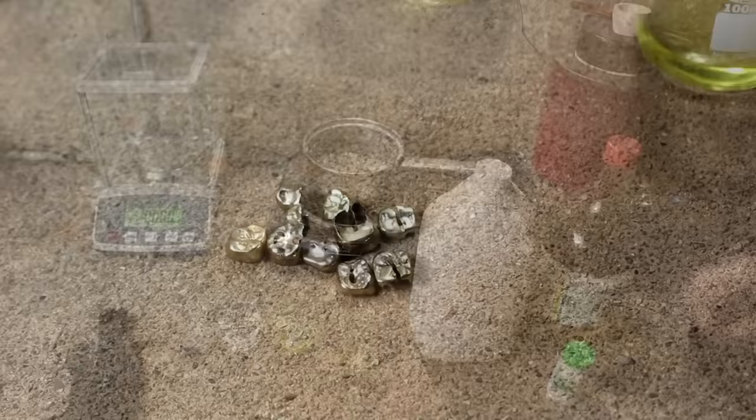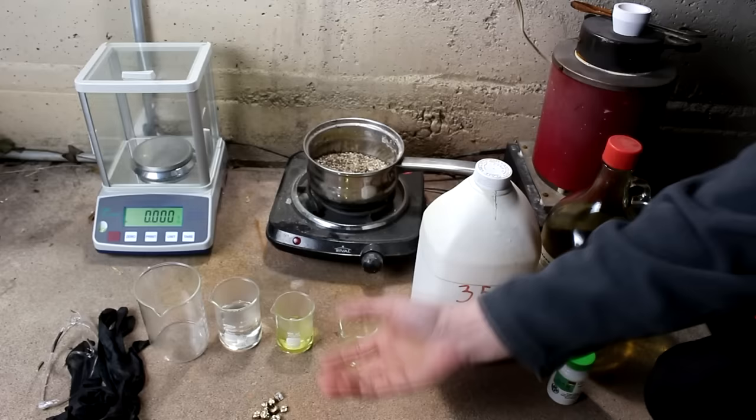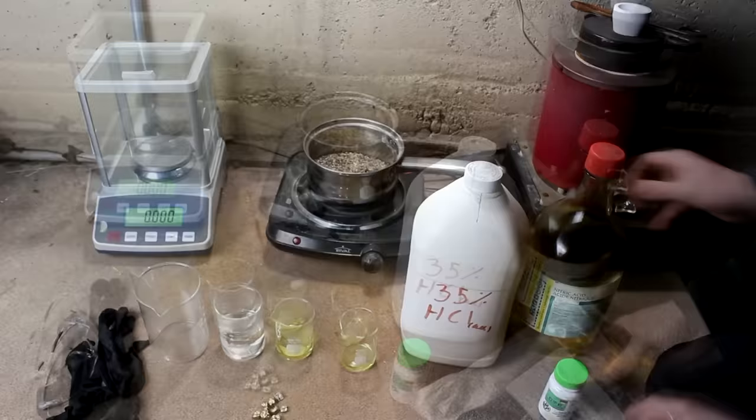I have everything here that I need to perform the task. For people who are newer to the series, I'm going to go through and explain what each of these are. In order to refine the gold, I first must dissolve it. Gold is very resistant to chemical attack, so the only thing that can really dissolve it is strong mineral acids. I have here some muriatic acid and some spirit of niter, otherwise known as nitric acid — 35% hydrochloric and 75% nitric acid.